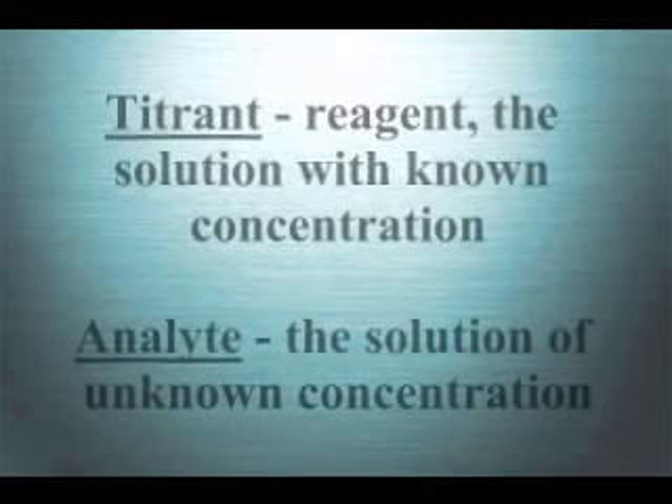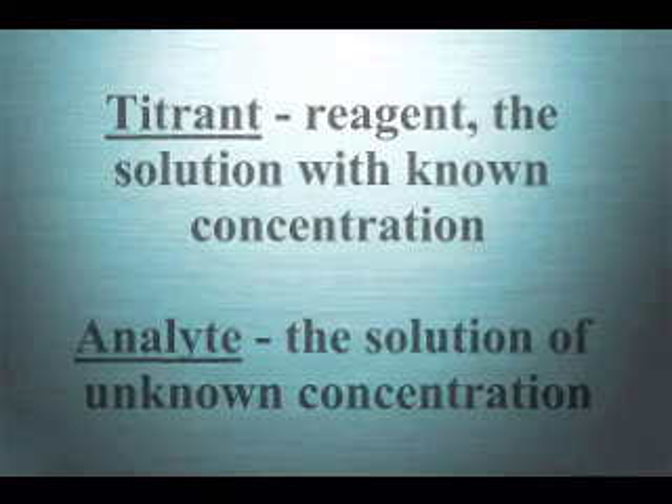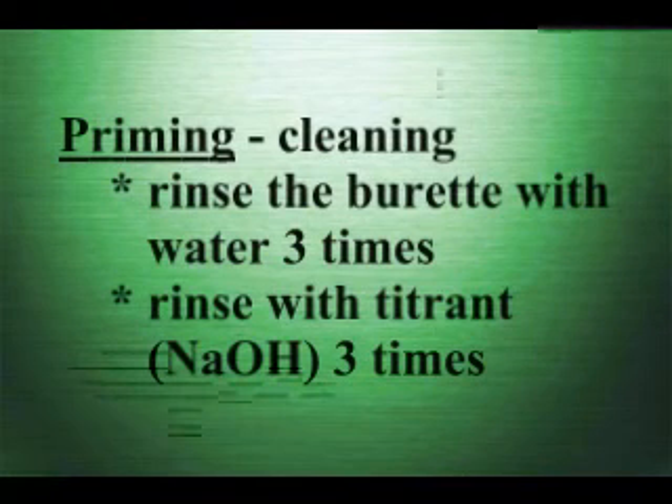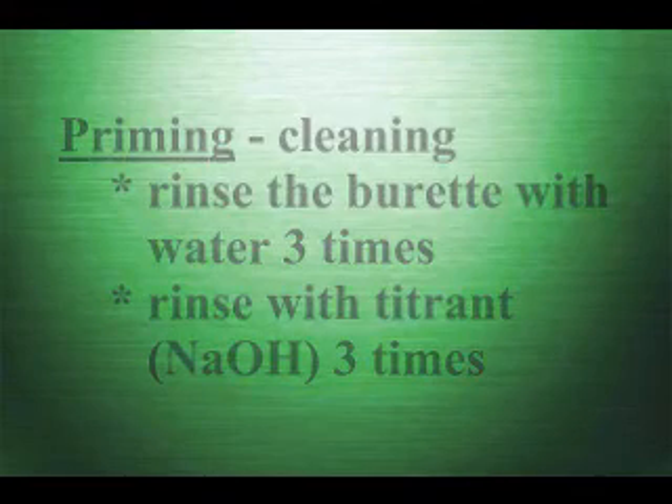In this experiment, our titrant is sodium hydroxide. Our analyte is a clear commercial soda. We will start off with a known volume of analyte: 15 milliliters. Before you begin the titration, you must make sure your burette is primed. To do this, rinse the burette with water three times and then with the titrant three times.